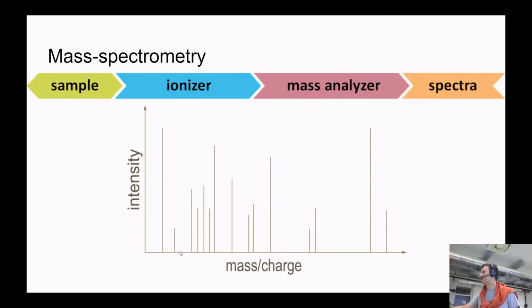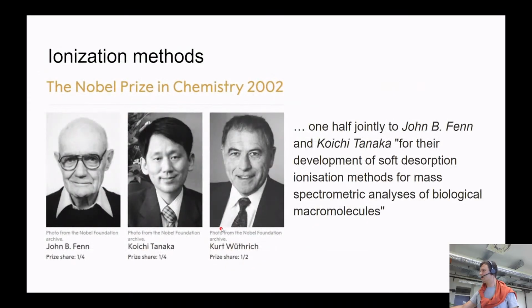Of course, that's mass spectrometry used a lot in the airports, as I said, but also mass spectrometry used a lot in life science. And that's not something which is all time here. Let's say mass spectrometry in bioscience, life science is something which happened to be true from, let's say, 1980s, 90s, etc. So we're going to discuss actually why. Actually, we're going to discuss it even now.